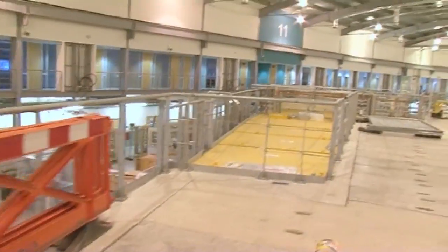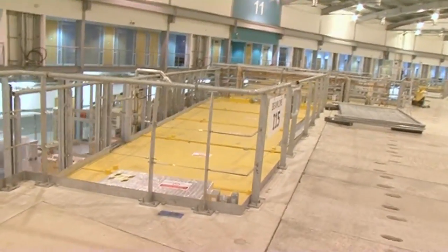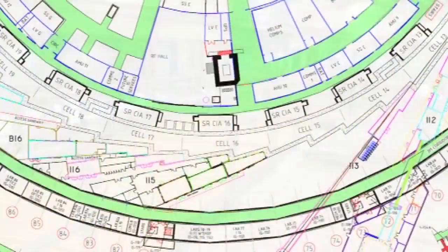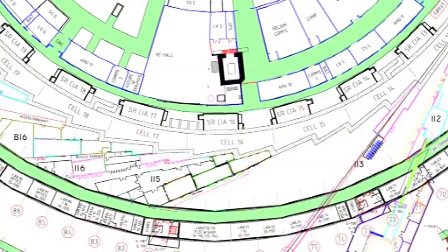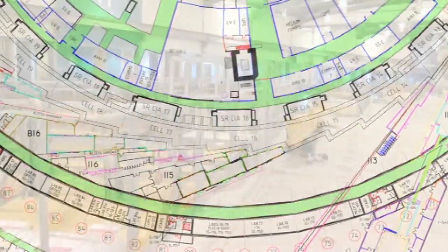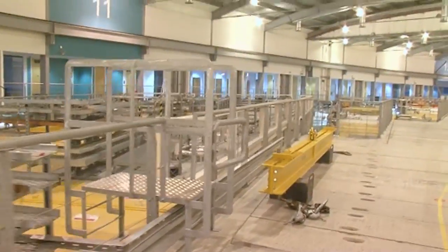I-15 is called the extreme conditions beamline, and it's able to recreate the conditions inside a volcano. We can look at extremely high pressure and extremely high temperature so that we can really understand how minerals form.